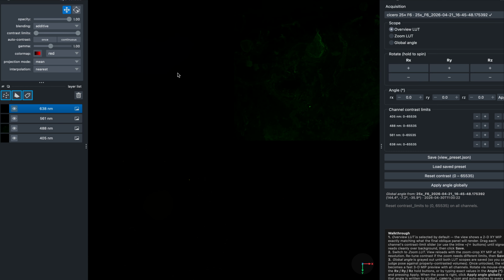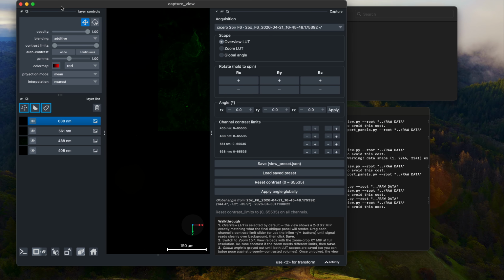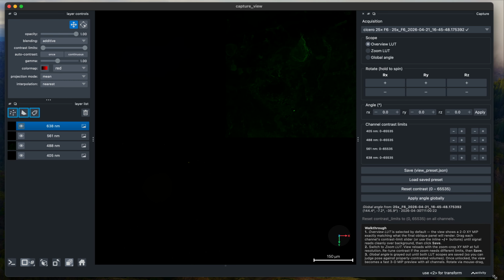This is a problem that this tool is actually solving, where it's relatively a pain in the neck, frankly, in just Napari to set these contrast limits. So I made some additional tools here to make that easier. Let me, sorry, this is in full screen. Let me resize so we make sure to capture all the different tool settings we've got here.